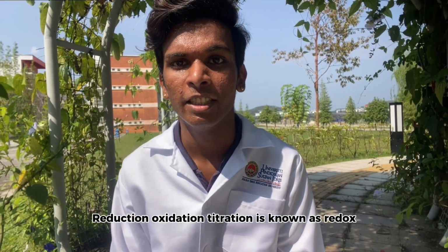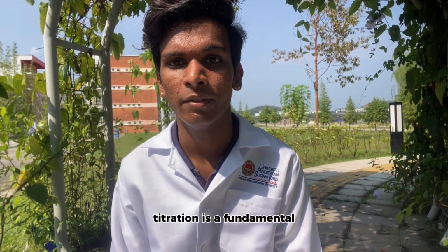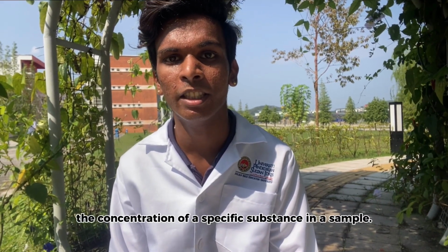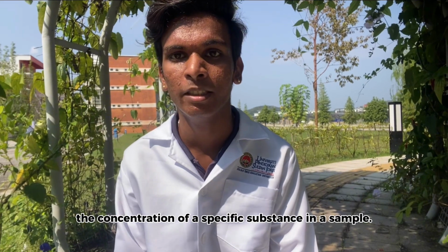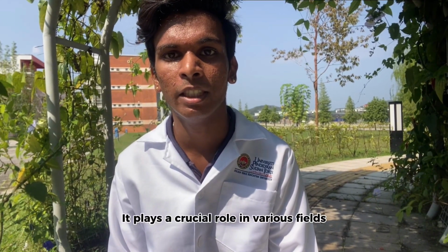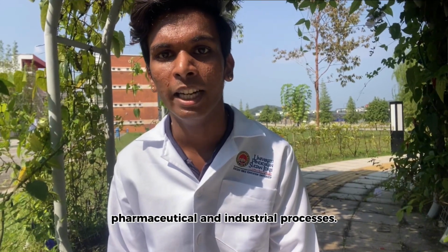Reduction oxidation titration, known as redox titration, is a fundamental analytical chemistry technique used to quantify the concentration of a specific substance in a sample. It plays a crucial role in various fields, including chemistry, environmental science, pharmaceutical, and industrial processes.